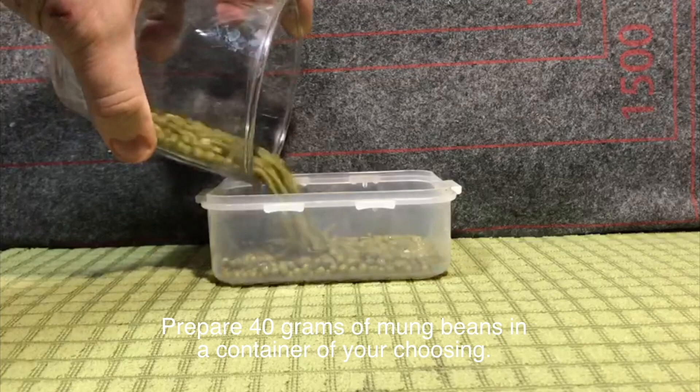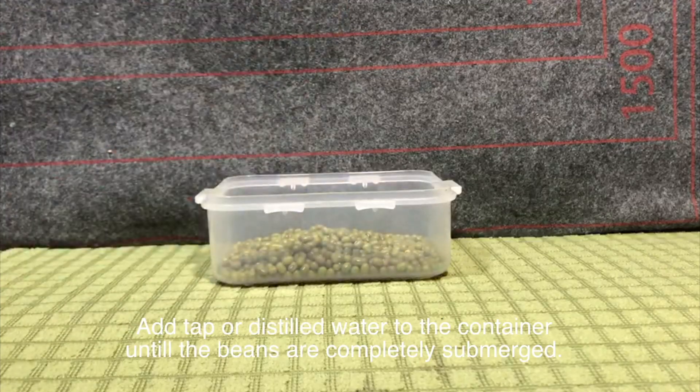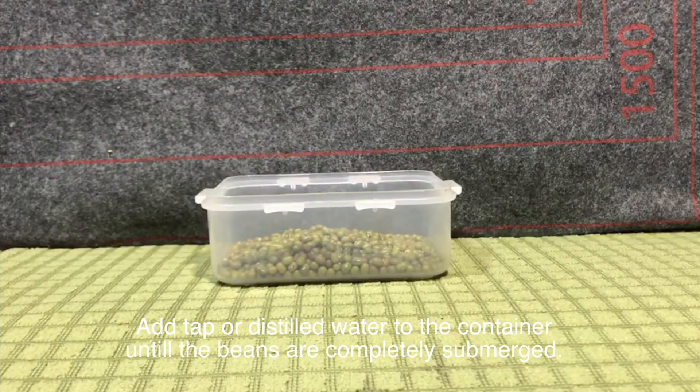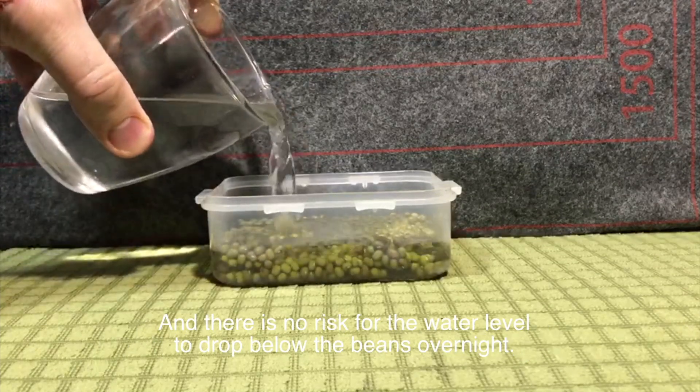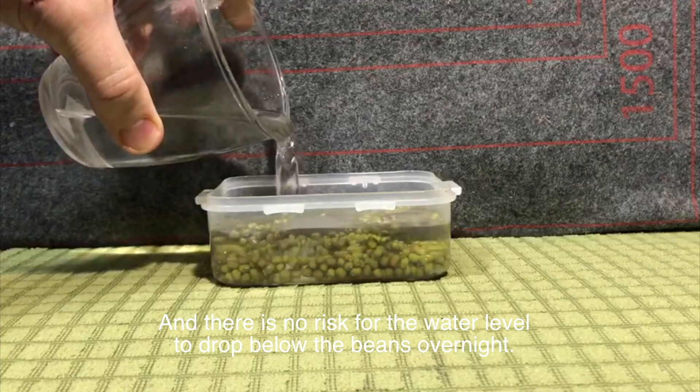Part one: overnight bean preparation. Prepare 40 grams of mung beans in a container of your choosing. Add tap or distilled water to the container until the beans are completely submerged and there is no risk for the water level to drop below the beans overnight.